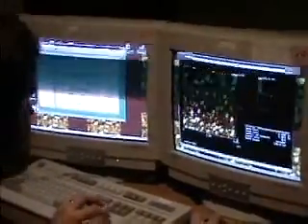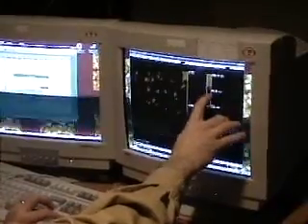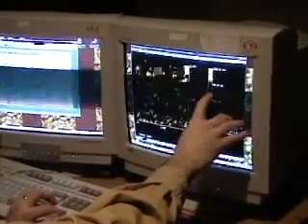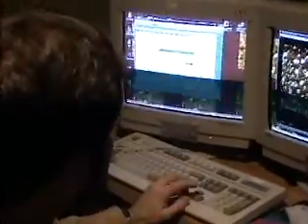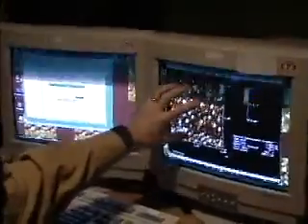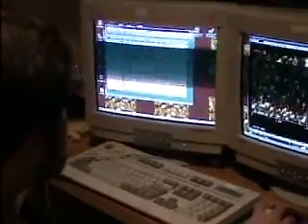And color offset, let me increase the color contrast again so we will see this more clearly. Now when I change the color offset, it's going to change where in this range from 0 to 120 nanometers does the transition from black to white occur. So depending on the particular image and what part of the image you want to pull out, you need to adjust the data scale, the color contrast, and the color offset so that it's displayed in the nicest way possible. And as long as you always include this Z-scale bar along with the image, it's still possible to interpret the data in a meaningful way. I'll quit out of that.